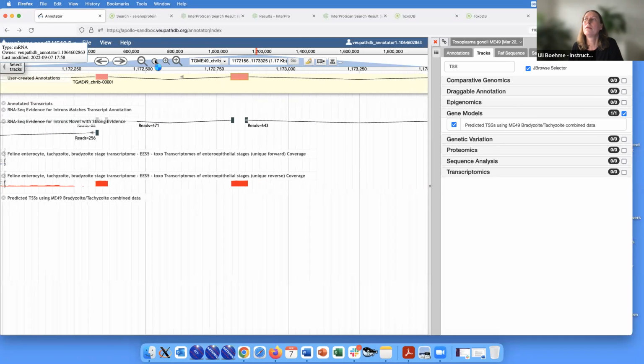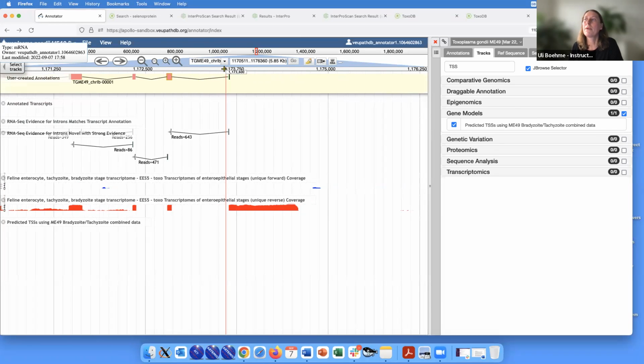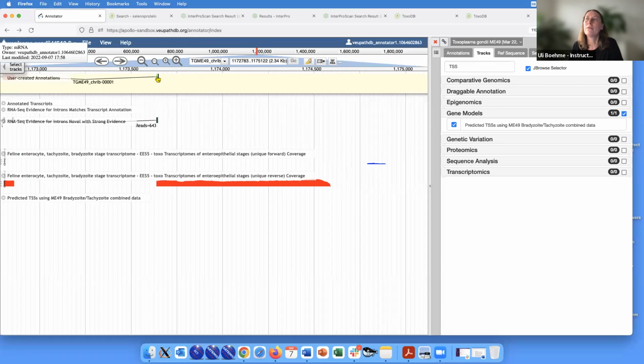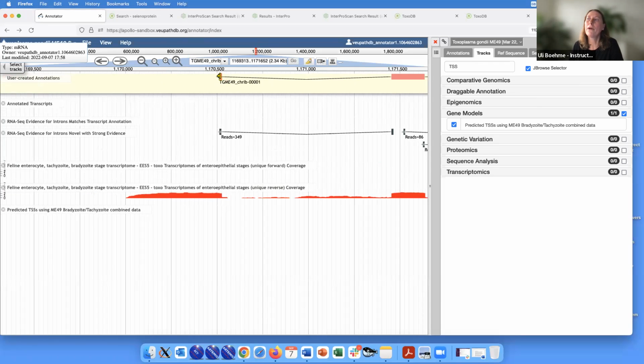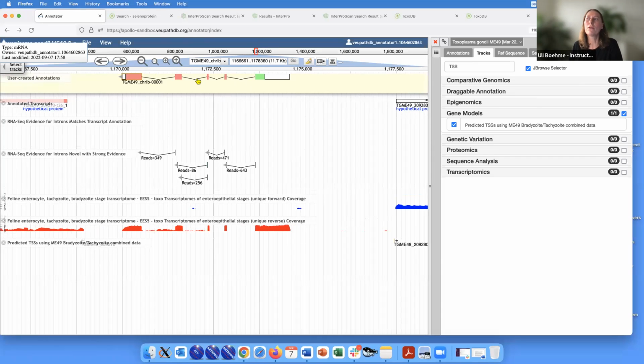So we're almost done. And it comes back to the question from Susanne. Now what Apollo does is look at the sequence, look where the methionine is, and then create the exon and the UTR here. And the same here for the 3'. Again, it looks at where the stop is, and then the rest is UTR. And that's it. Incredibly easy, creating new gene models.